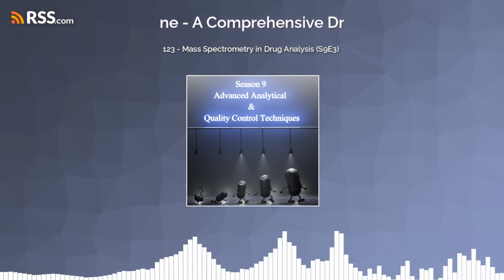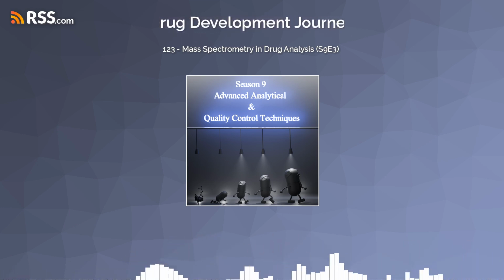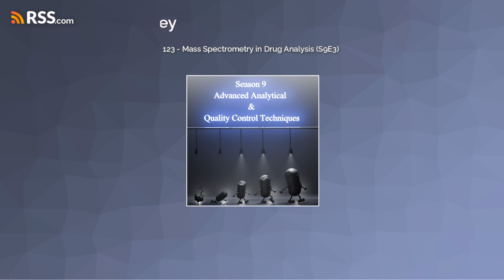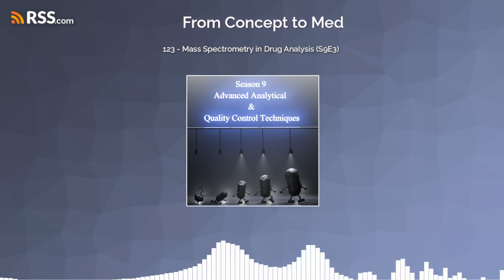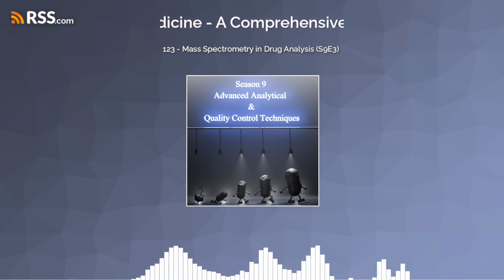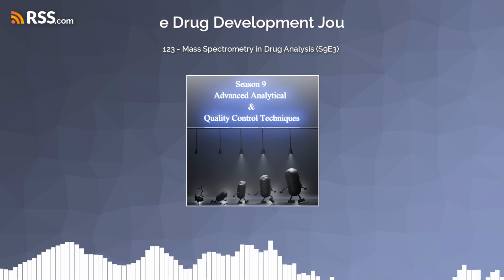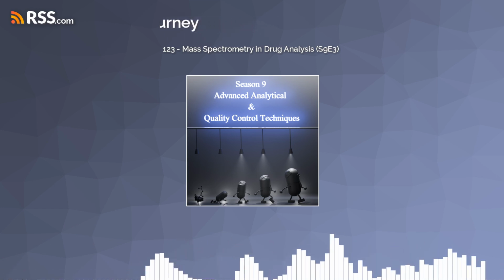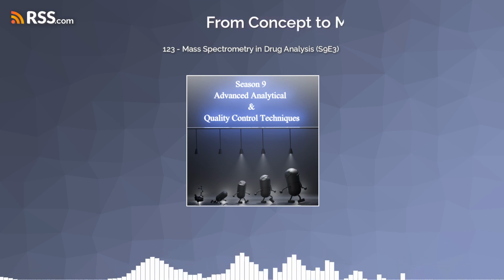You wish. Identifying unknown impurities, for example, and figuring out if they could be a problem, that can be really tricky. It involves a lot of detective work. Comparing the data to libraries of known compounds, meticulously analyzing how those molecules break apart, sometimes even using other analytical techniques to confirm what we think we've found. Sounds like solving a really, really complicated puzzle. You could say that, and we're not doing it alone. We use sophisticated software and huge databases that contain information about tons of chemical compounds.